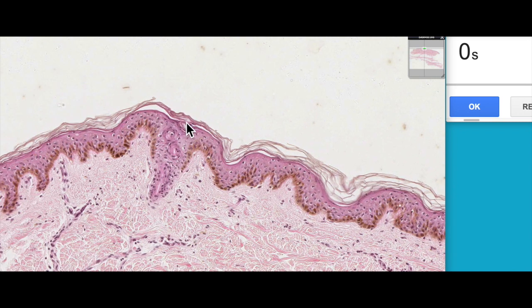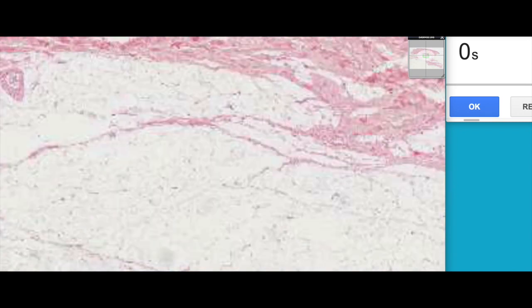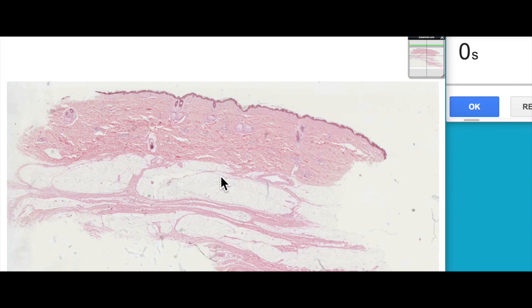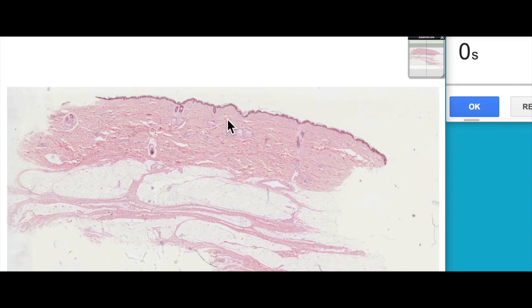That was an overview of interpreting low-magnified views of the skin, particularly the dermis. Hopefully you found that useful. We'll look at the structure of the dermis in a little bit more detail in future videos, so I hope you'll join me.